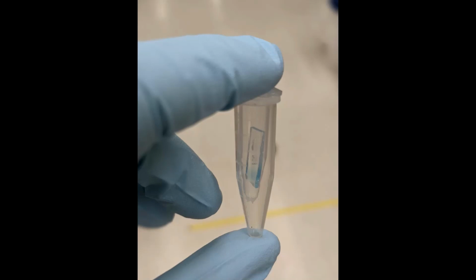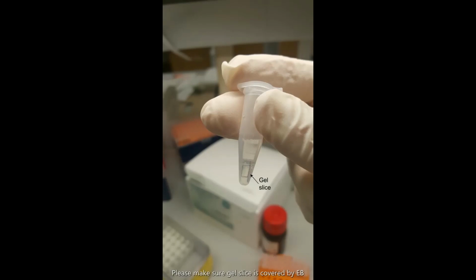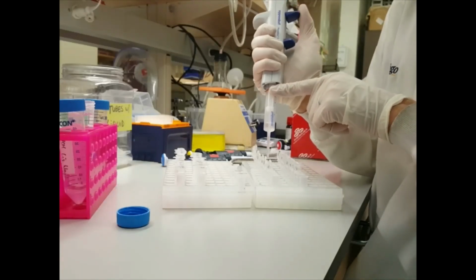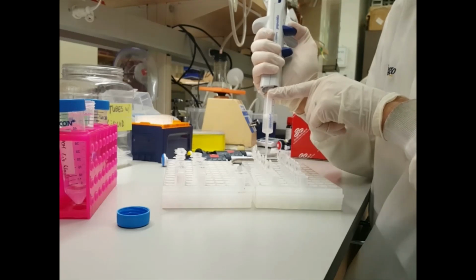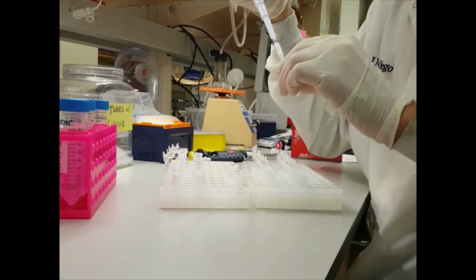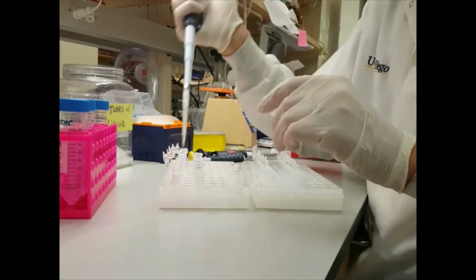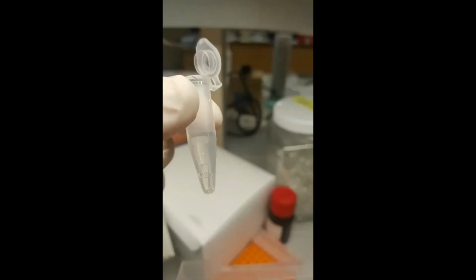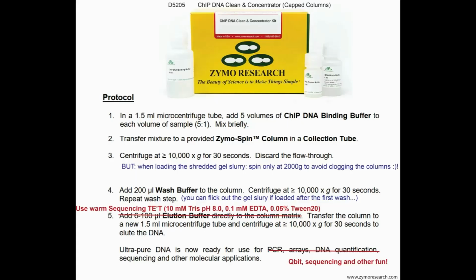Otherwise, if you're lazy like me, just cut the gels, maybe slice them in half, and then elute them overnight in 150 microliters of gel elution buffer. Whether you had a slurry or eluted overnight, next, you can purify your libraries using the column kit. Add 5 volumes of DNA binding buffer and transfer everything onto the columns. If you had a slurry, after the first wash, flick off the gel pellet. Otherwise, purify DNA exactly as described by the manufacturer.